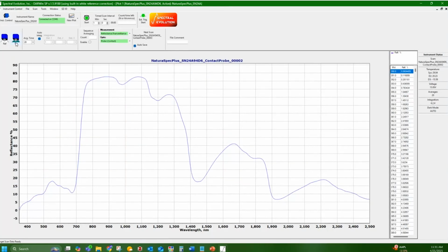There we go. Now, if I wanted to use the external trigger, I would just simply hit external trigger, and all of this is grayed out because it's assumed that you're no longer using the computer to control it, but actually the triggering accessory. And then I'm going to scan this piece of lepidolite, and it will change.